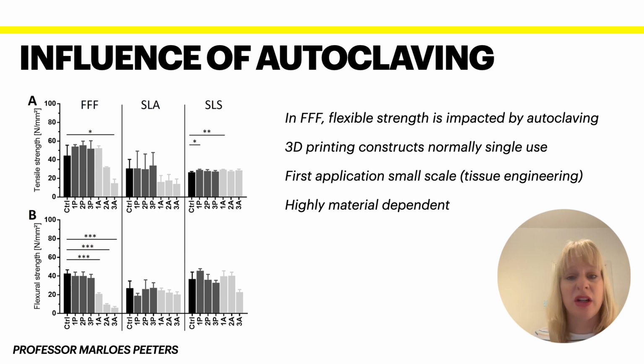So what could be an advantage of this is that you could use this as prototyping again, where you would consider printing different types of models and you would see what the impact of the different geometries or the different shapes is on the performance of the reactor.